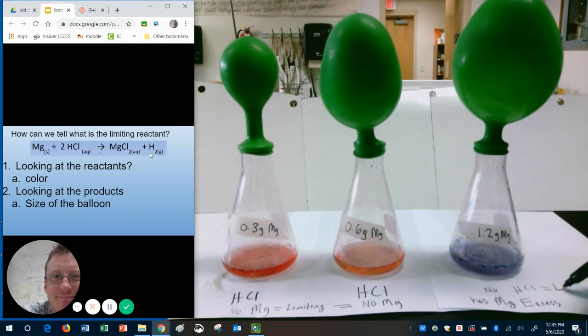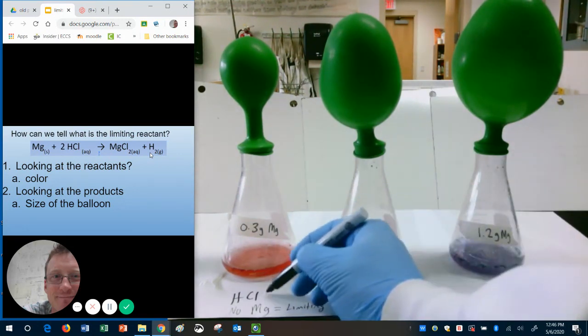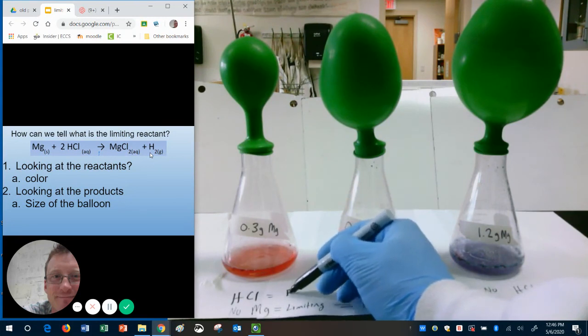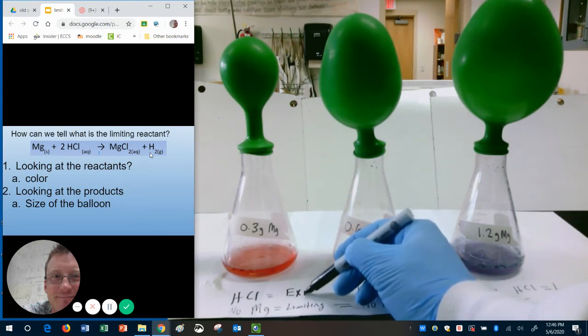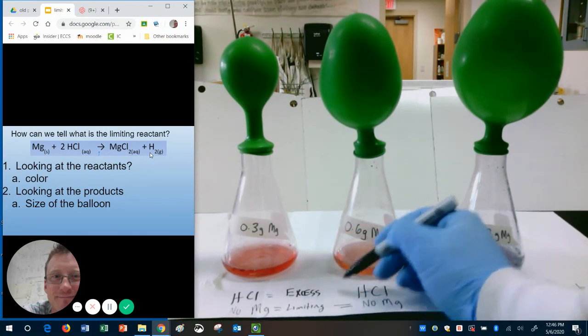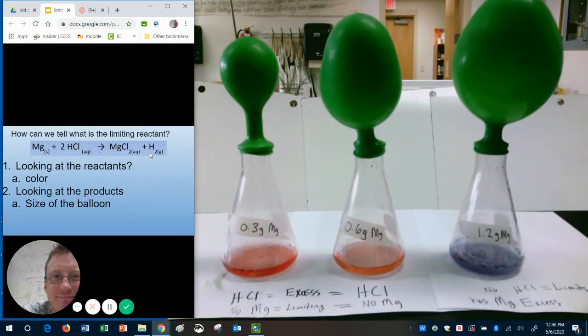And then the HCl is what limits. In the first ones, what must be the excess? It must be the HCl. Because there is HCl left over. That's what excess and that's what limiting means. So, there is an experiment that visually shows you how that happens.